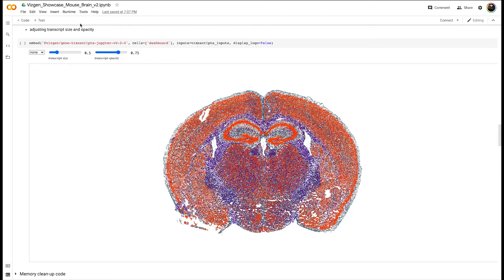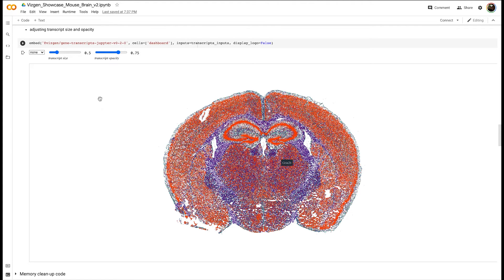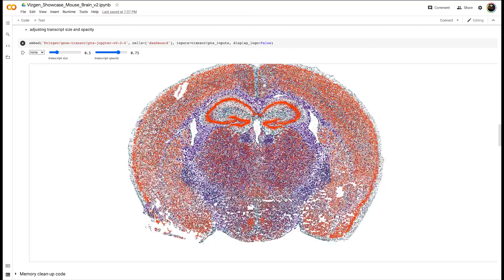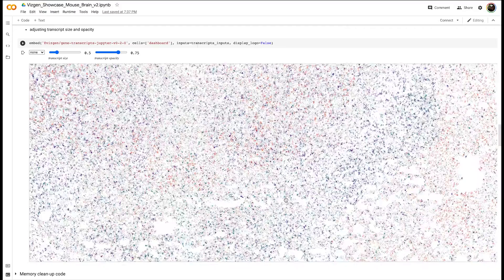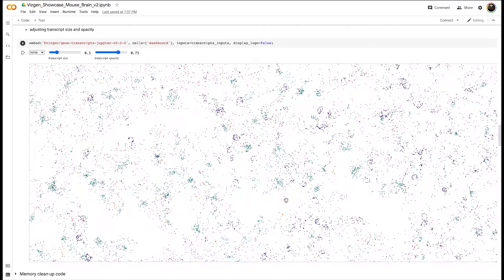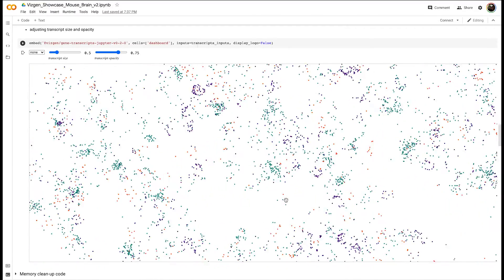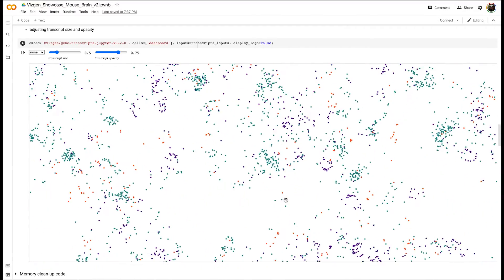This interactive visual shows over two million individual transcripts from three genes of interest. We can zoom in to see the actual location of these transcripts in incredible detail within the tissue and get an idea of their complex spatial localization and interrelationships.